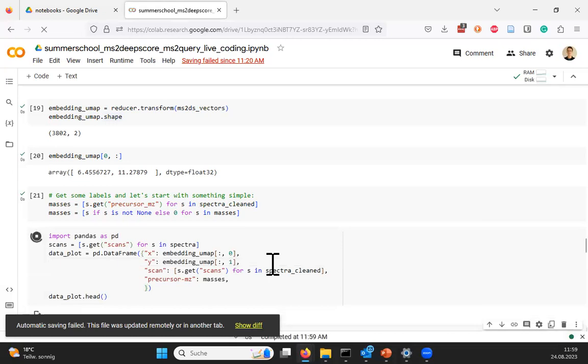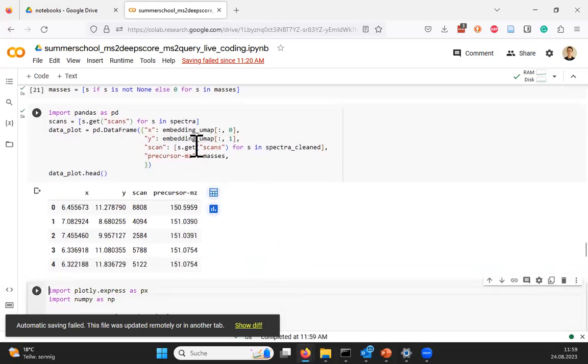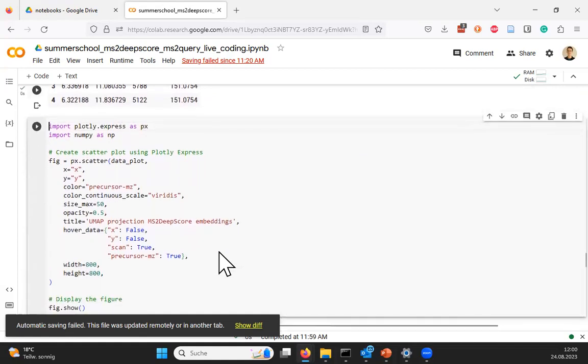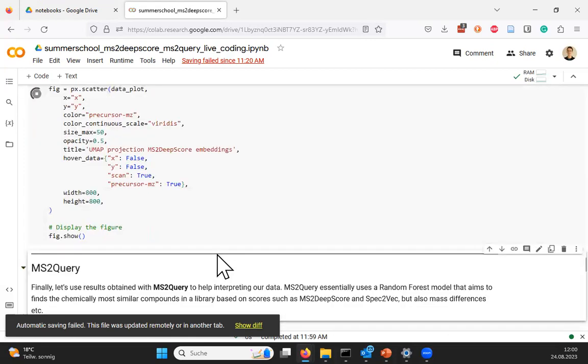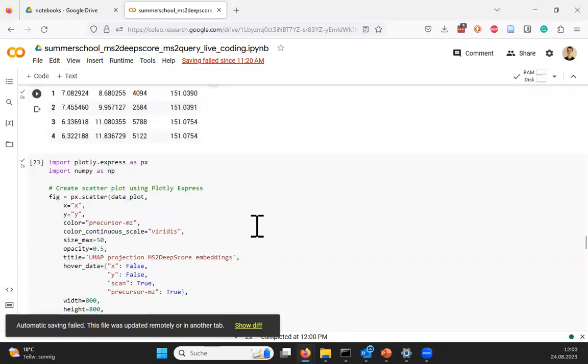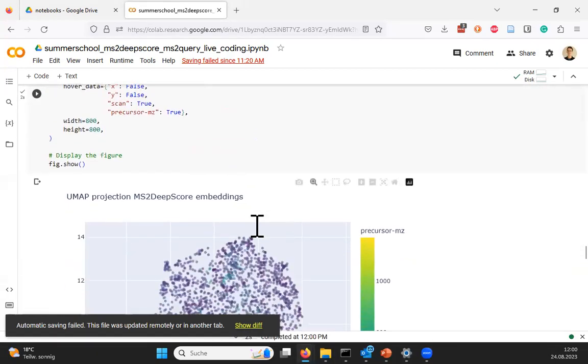I added this, so you can skip this part, just believing that it's putting this into a table. And the nice thing about these kinds of notebooks is that you can plot things nicely. This uses a JavaScript-related library that works in Python, and it allows you to do interactive plots. The complicated part is the computation, while the simple part in Python is usually the plots.